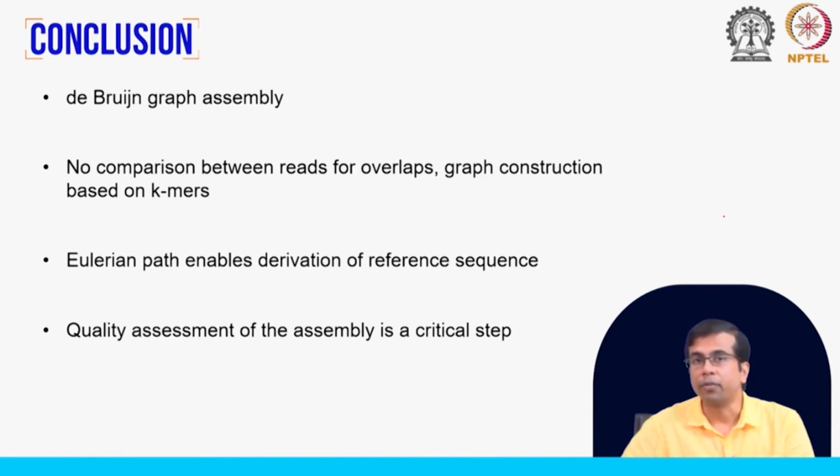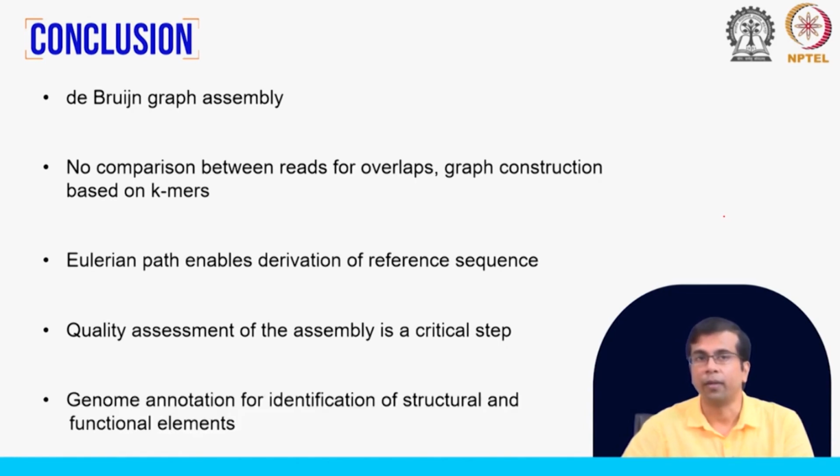We have talked about assembly quality assessment, because once we have done the assembly, we want to check how good the assembly is. The tools and algorithms that we have described, as you can see, are not perfect. There is still a lot of scope for improvement.